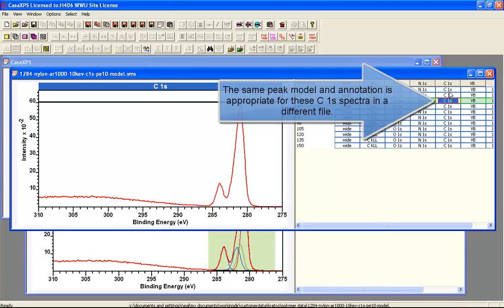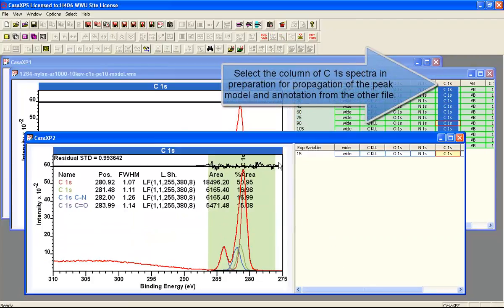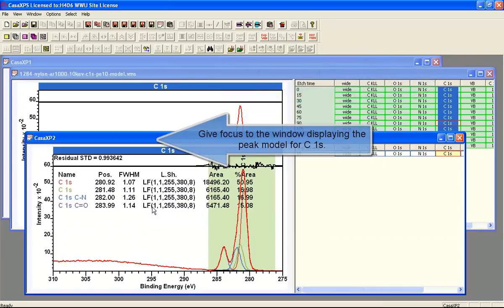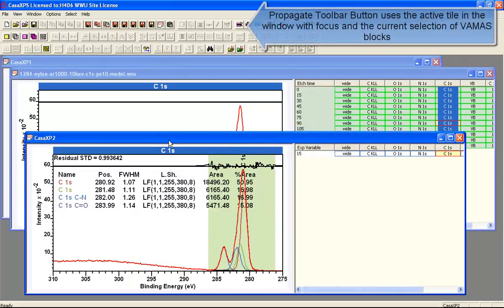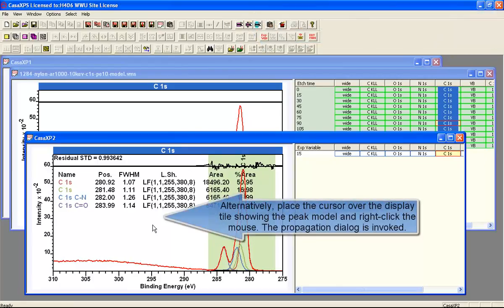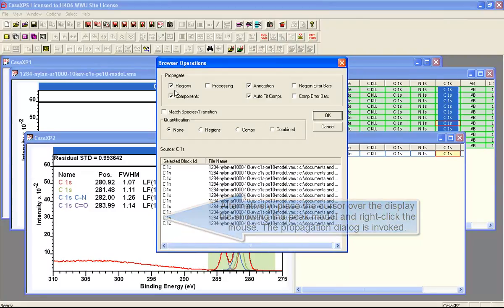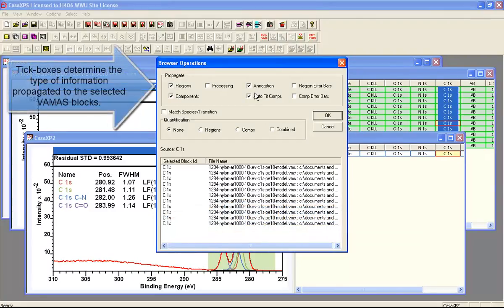If I select these in the right-hand side, then I go back to the file that contains the peak model. I can use either a toolbar button which says propagate to the selection, or I can right-click over the data and then I can propagate regions, components, annotation, and autofit.